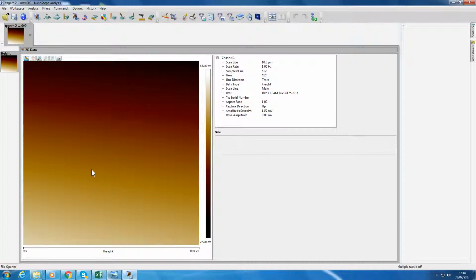Now you may not see nanofibers there, they are there, but the image needs to be leveled, so it's too high up in this region and it's further down on the top right here. So this is typical with an AFM image, you get this tilt. So we remove this in one of two ways.